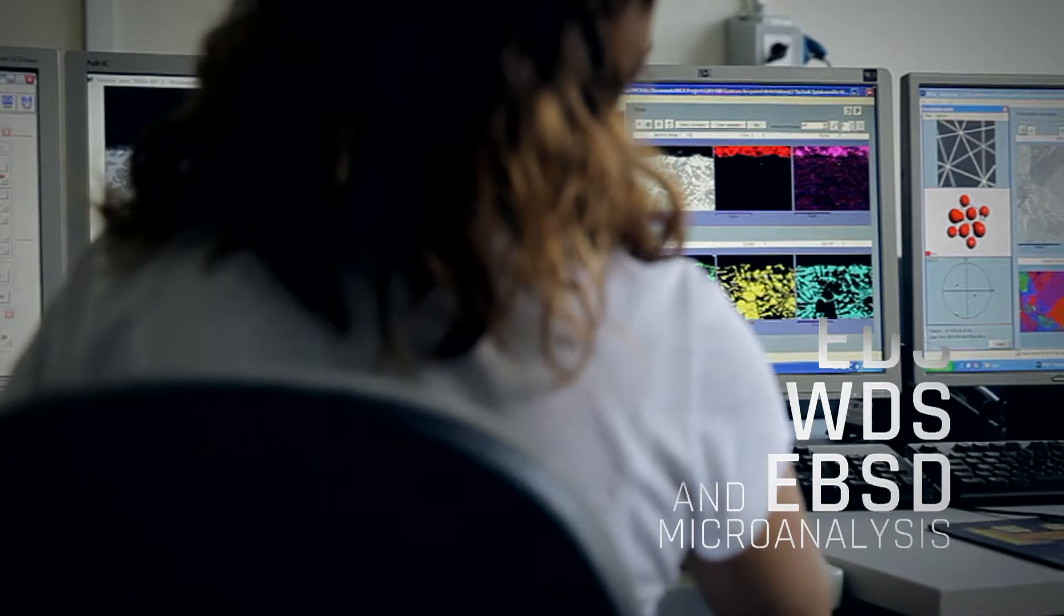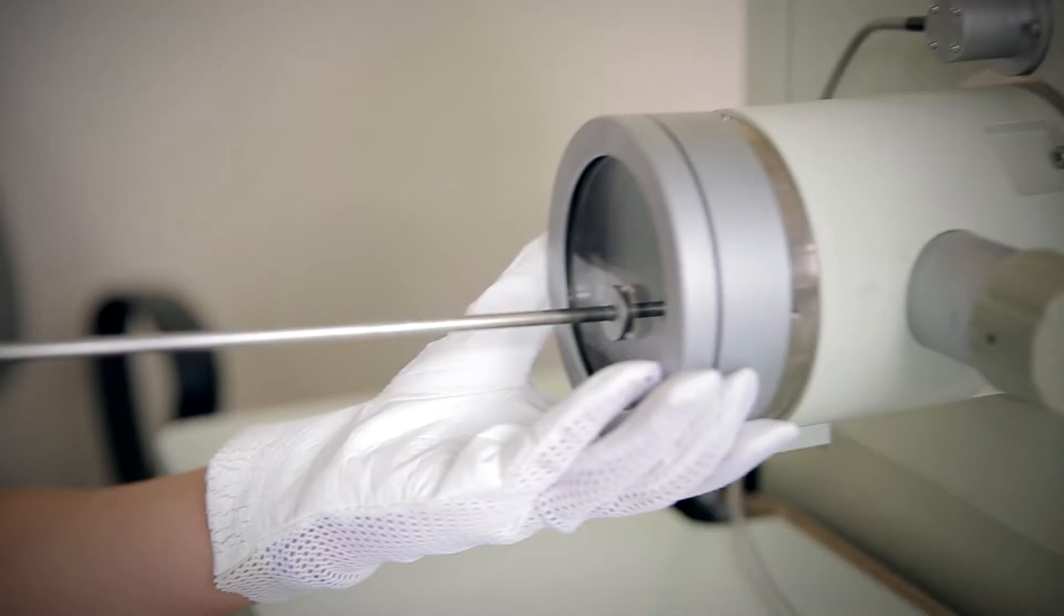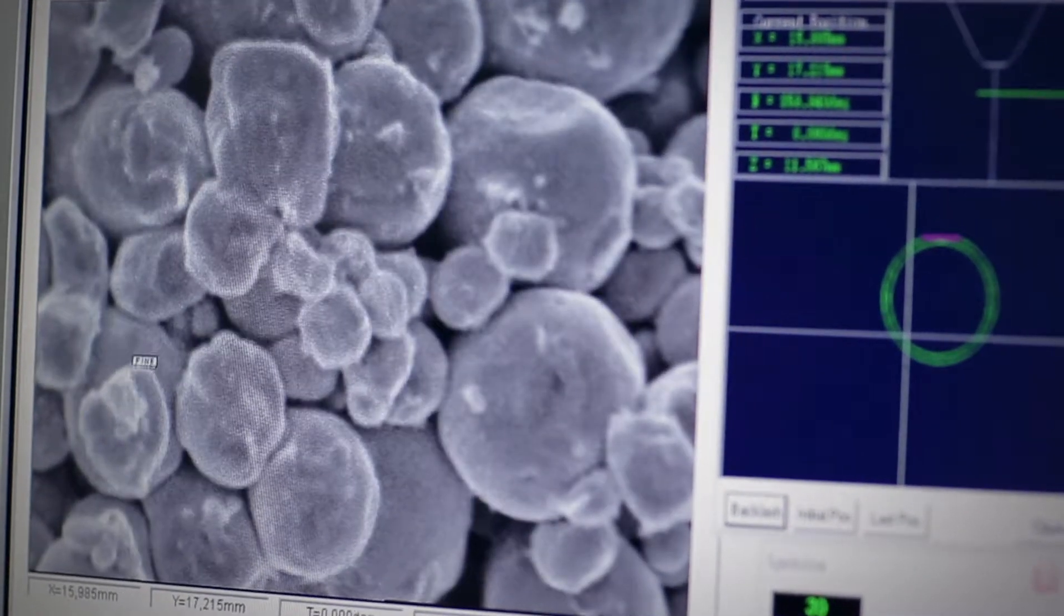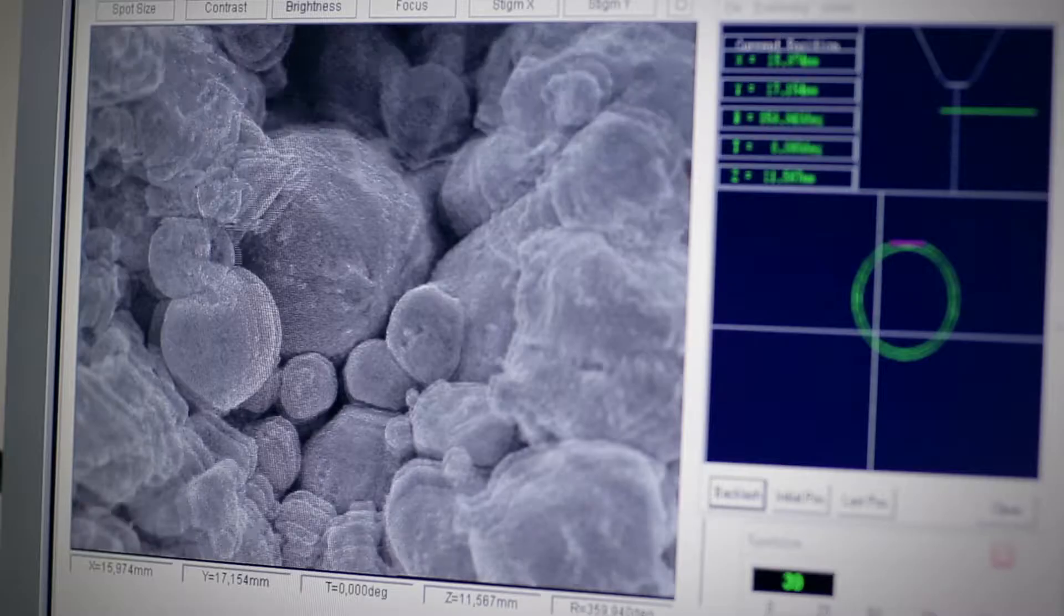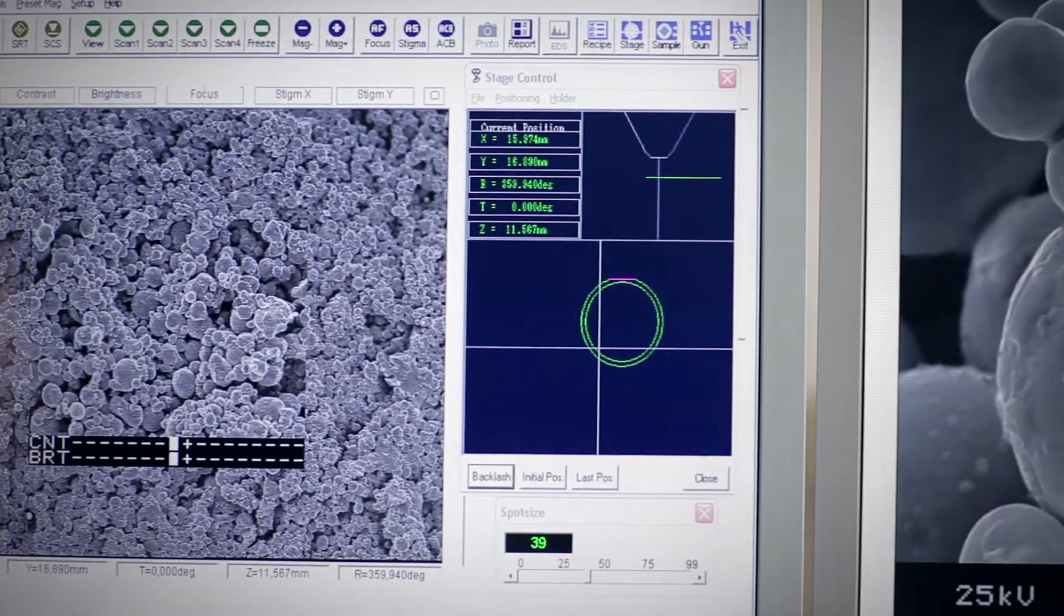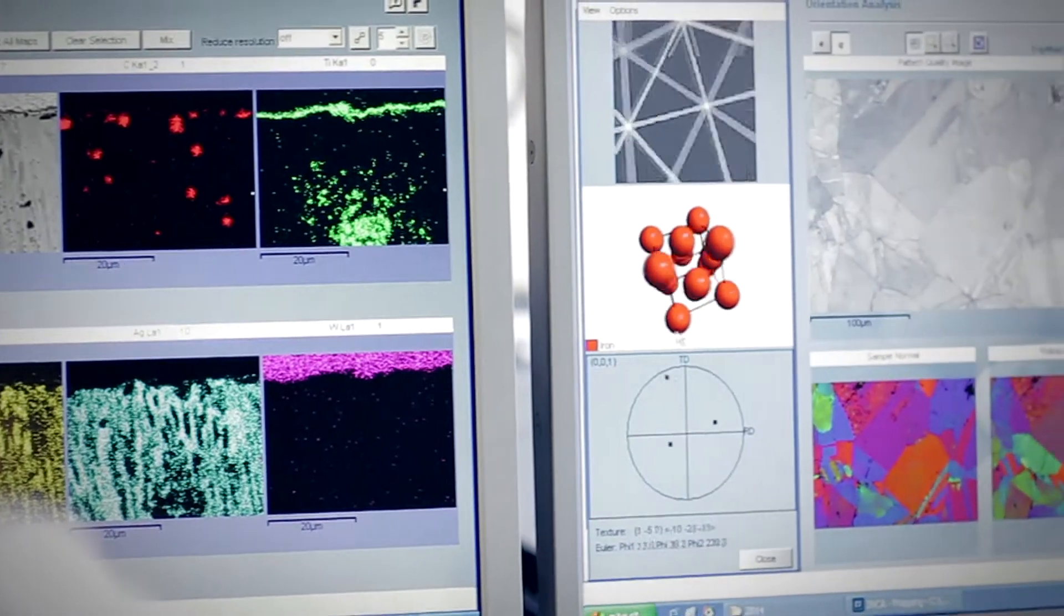Material microstructure analysis is performed with a scanning electron microscope. Evaluations are possible in high and reduced vacuum. Microscope accessories include a kit of spectrometers for qualitative and quantitative microanalysis of element contents and a system for electron backscatter diffraction analysis.